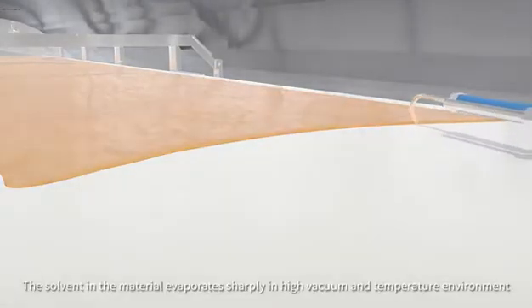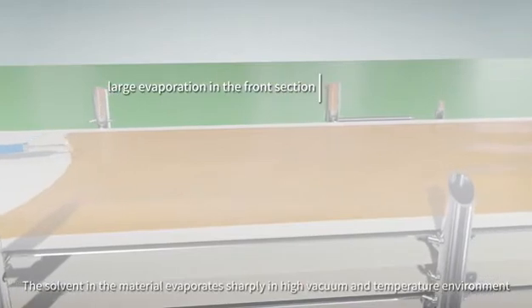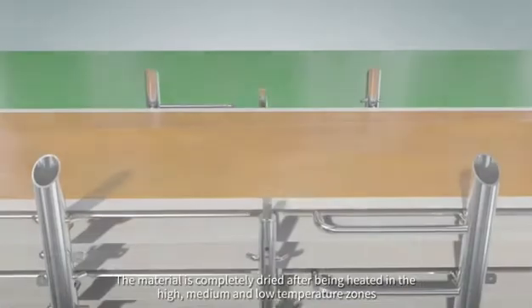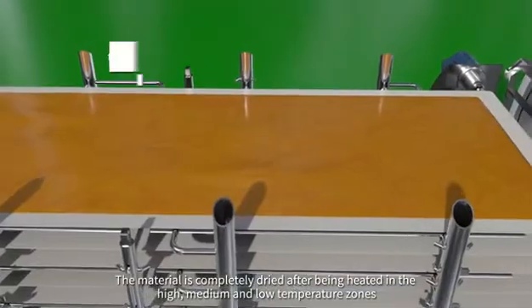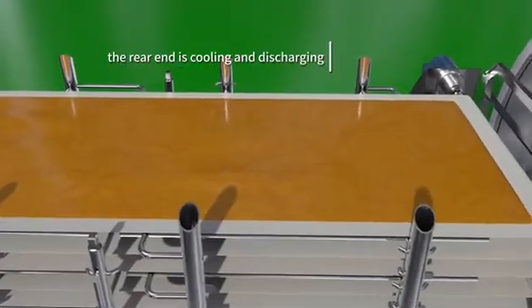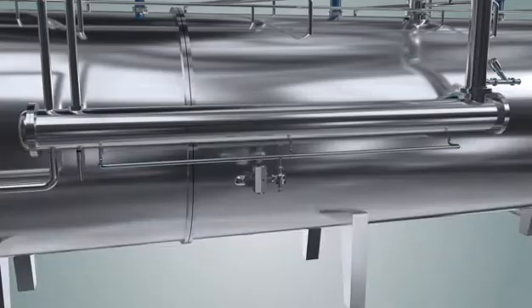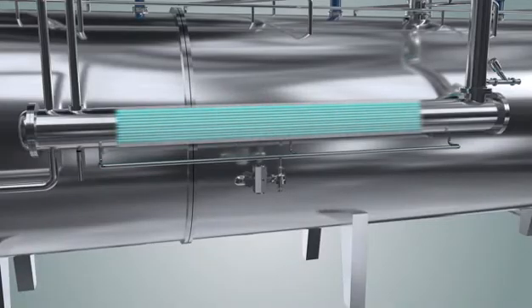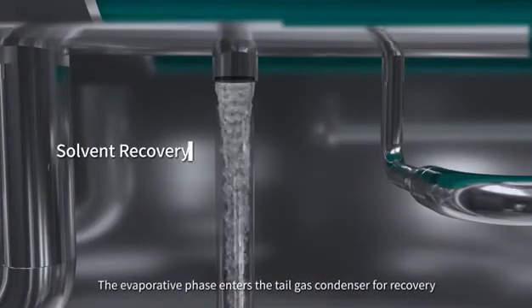The solvent in the material evaporates sharply in a high vacuum and temperature environment. The material is completely dried after being heated in the high, medium, and low temperature zones. The evaporated phase then enters the tail gas condenser for recovery.